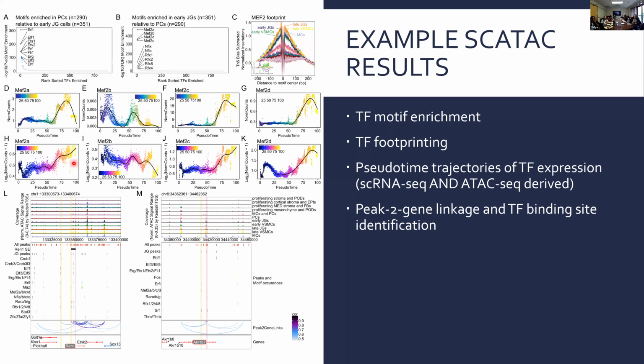And this is where I was saying the gene score versus gene expression actually tracks similarly. So the top row is gene expression, because we did have integrated single cell RNA-seq data to go with the ATAC-seq. And the bottom one is the gene score. So this is the gene expression derived from accessibility readings. The interesting takeaway is that when you have high gene expression, you do see that the accessibility predicted it to be highly expressed. So even when you don't have RNA-seq data, you can feel relatively confident that your predicted value is pretty plausible for what the gene is doing in the cell you're studying.